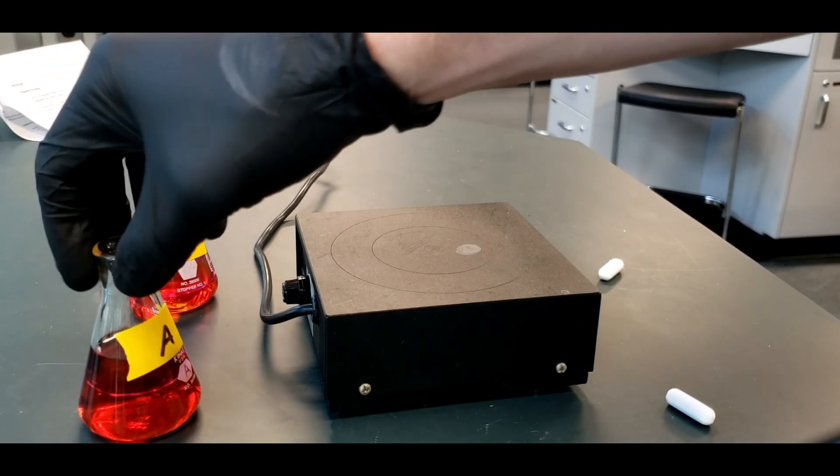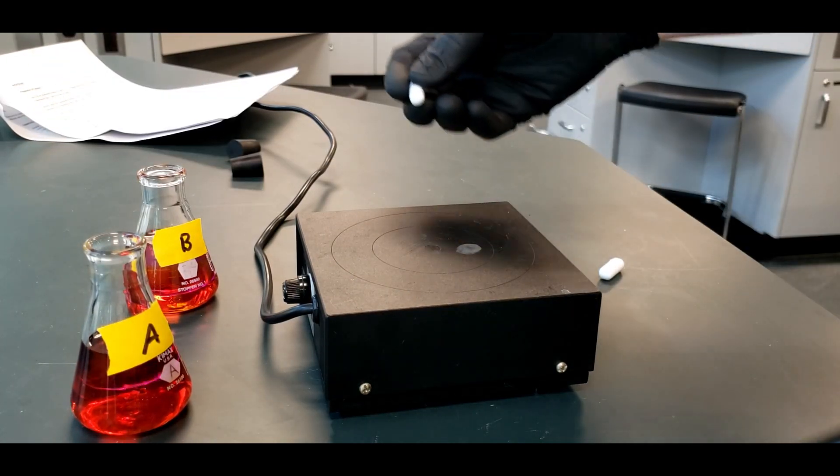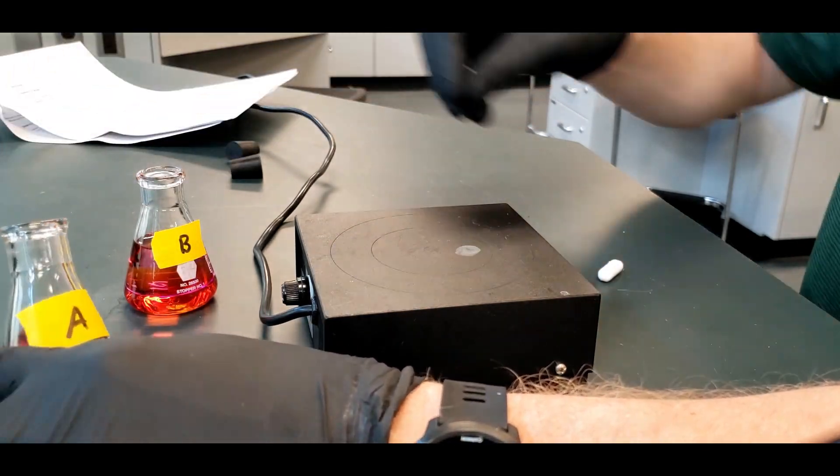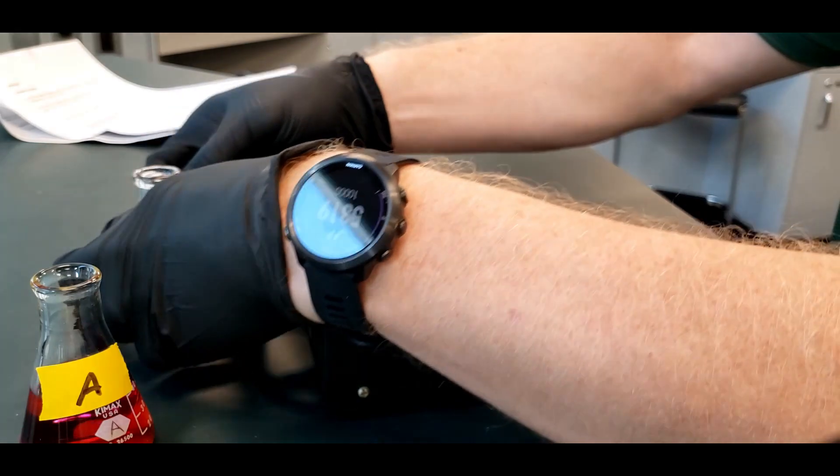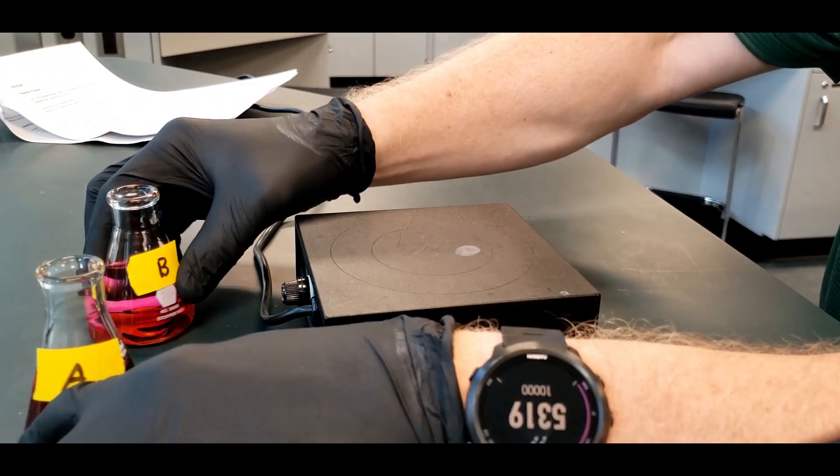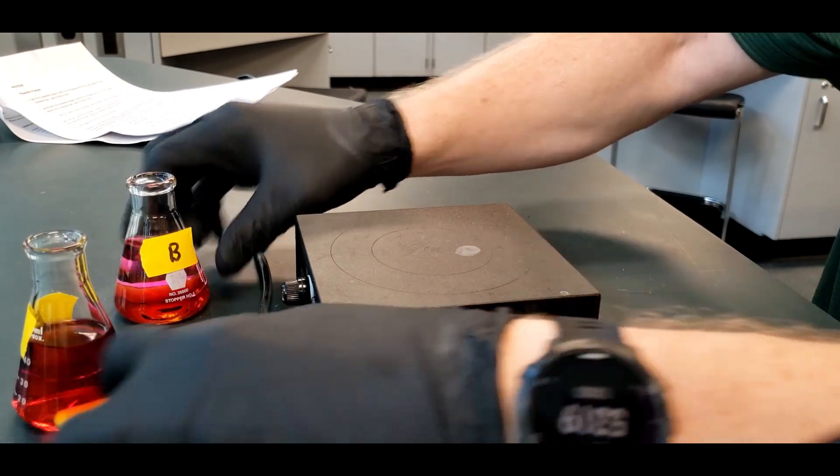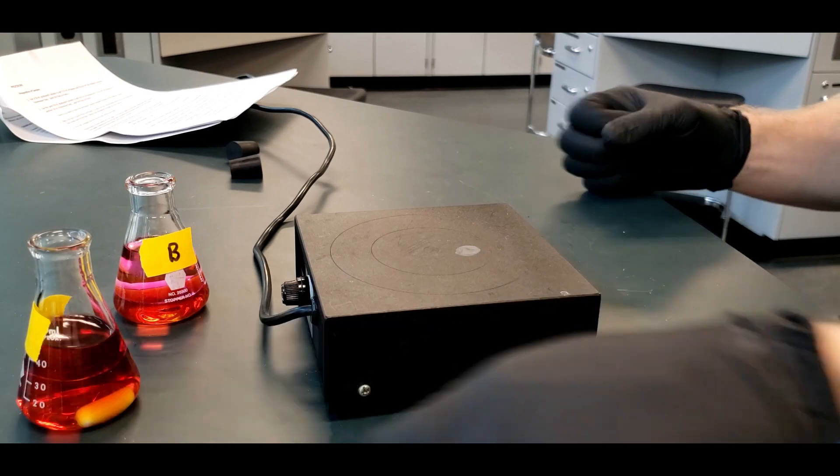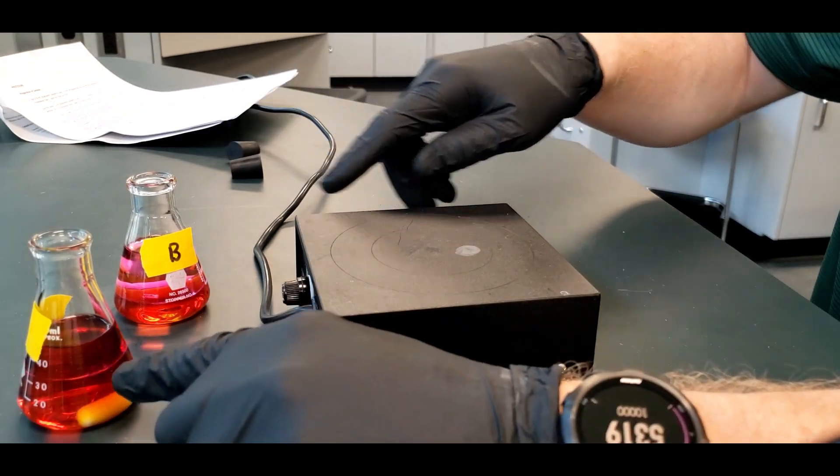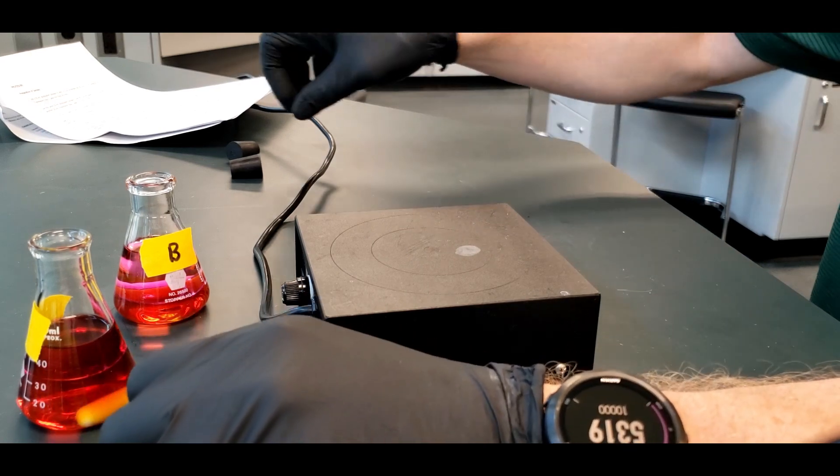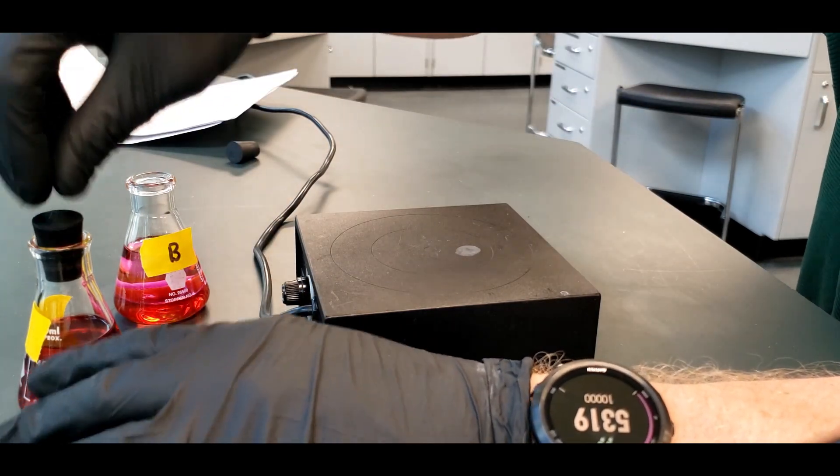So the next step, we're going to put in the stir bars into each. I'm going to slide those down the side. Probably wouldn't break the glass, but it would definitely cause some splashing. Because these volumes are pretty high. And I'm wearing gloves because of the iodine mainly. Hexane is not good for you either, but the iodine definitely will stain. That's why I have gloves today.